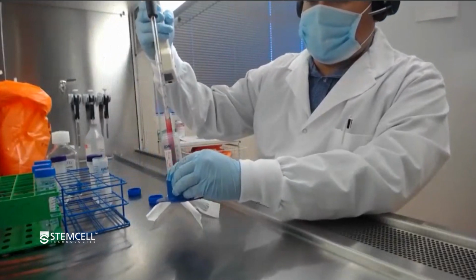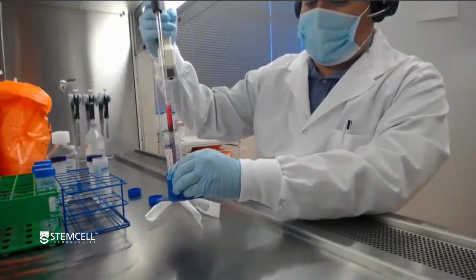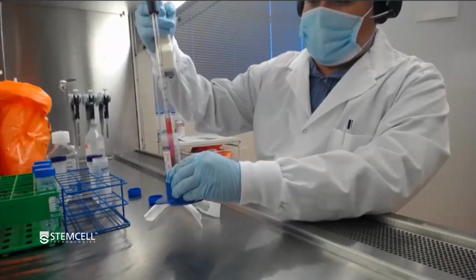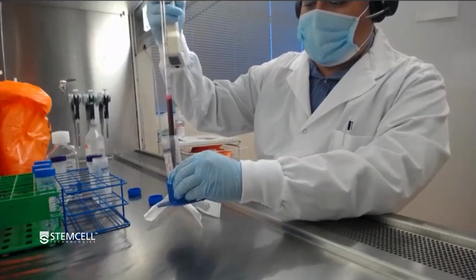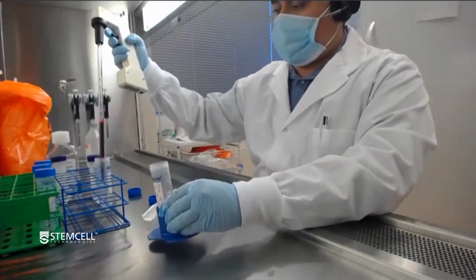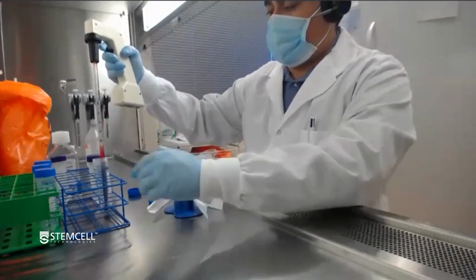So here I'm just going to do a quick little mix before I aspirate. That's 5 mils. Dispense this into the dilution tube.